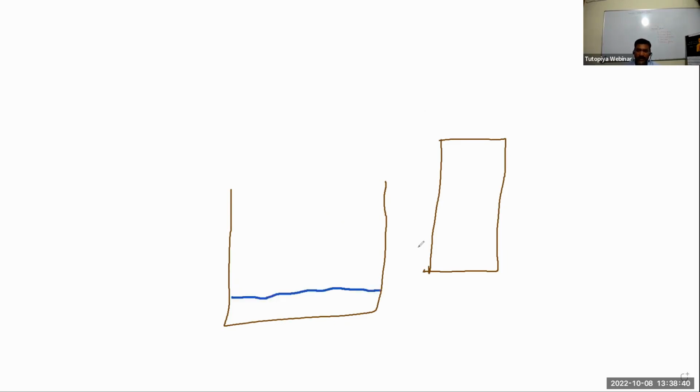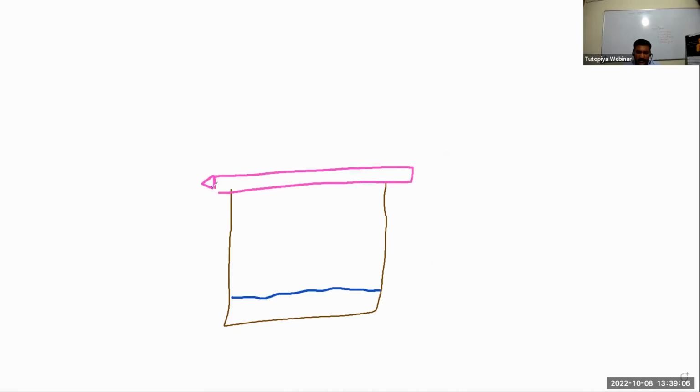And now I'm going to put this tissue paper, or the chromatogram or chromatography paper, inside this. You even get ready-made chromatography papers which are called chromatograms. Chromatogram or chromatography paper is the same thing. Now I'm going to put this in here. So what happens? I suspend it with a pencil here, and this is my paper.